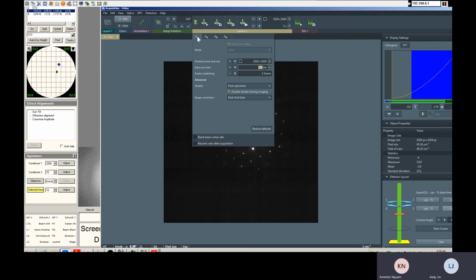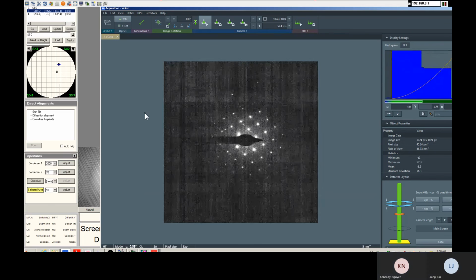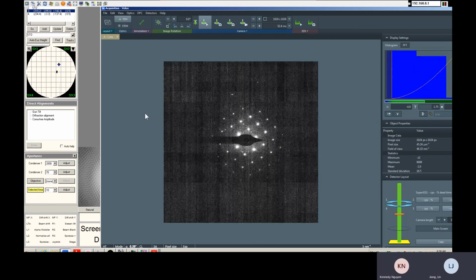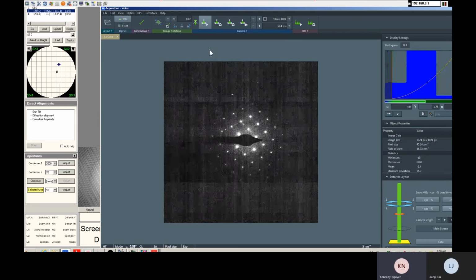Let's check the live. Let's go to the lowest first. One frame. Play. What's the count? Okay, 6,000. We'll leave it there.